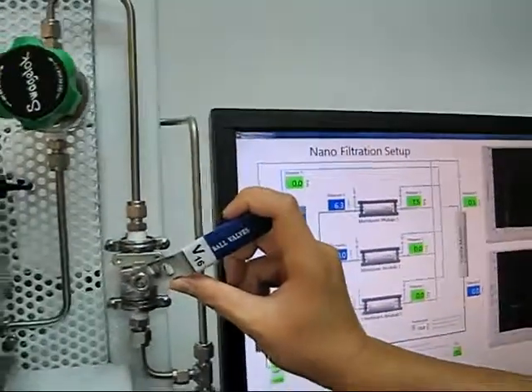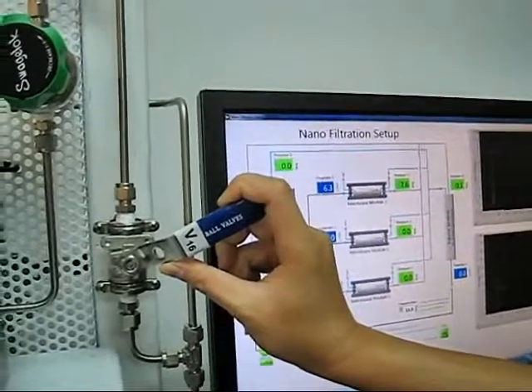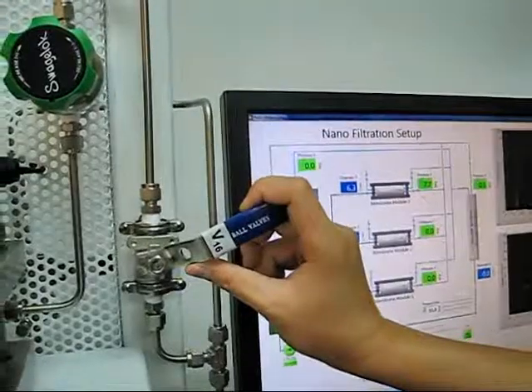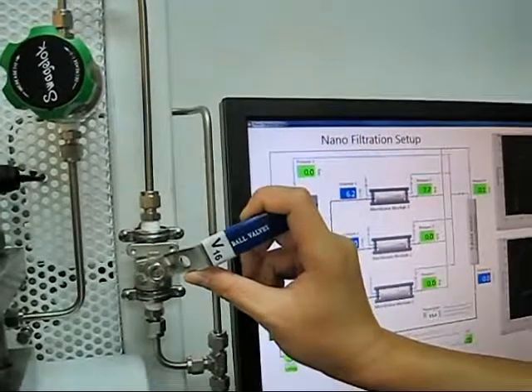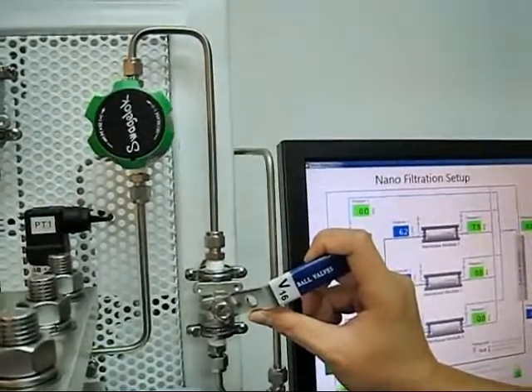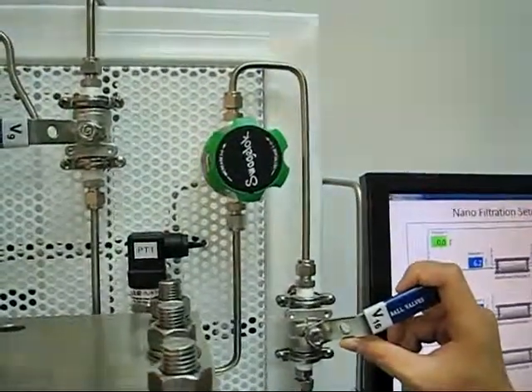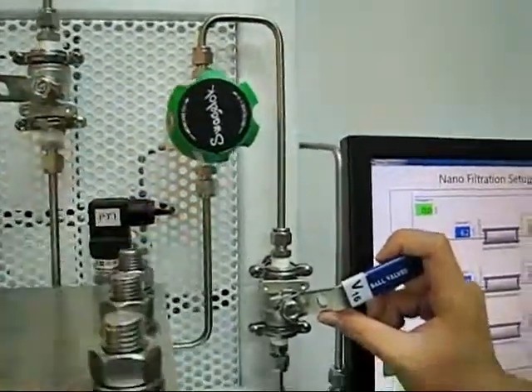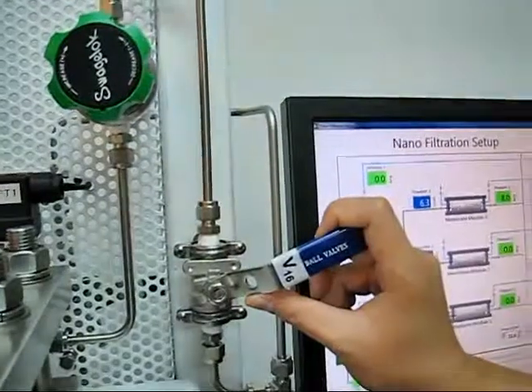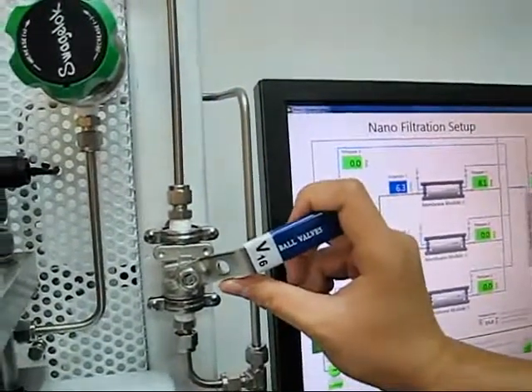We realize that adjusting valve V16 is a very effective way to reduce the amount of vibration caused by the high pressure pump on the back pressure regulating valve. So, the very initial valve adjustment can be achieved by using V16.